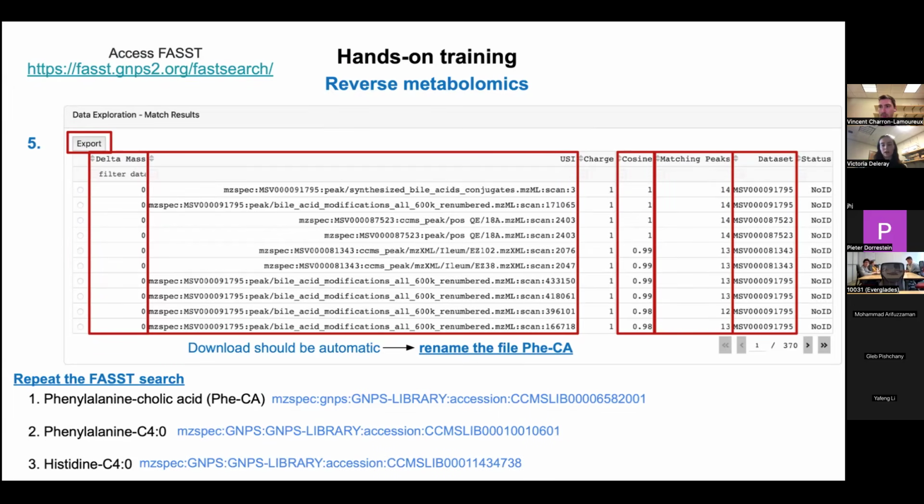So does anyone not have the file that we either just sent in the Zoom chat or in the email yesterday? That's awesome. Okay, I think we've had enough time to play around with this interface, and maybe we have all our data tables ready.